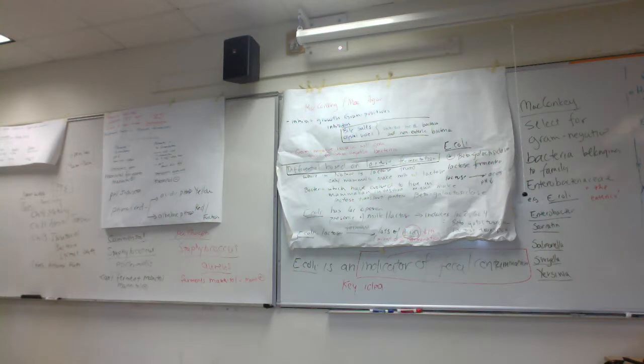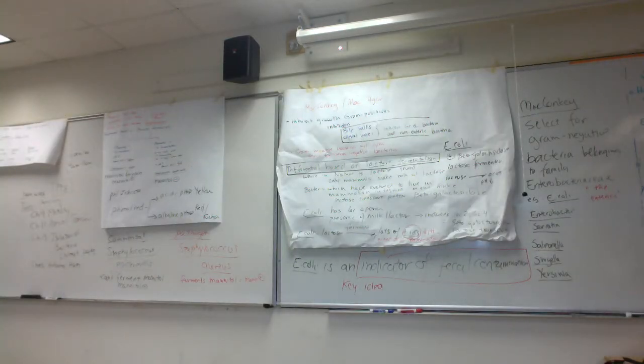So really today it's just a matter of looking at the demo mannitol salt plates, looking at the demo MacConkey plates, looking at the demo blood agar plates, right? And thinking about, is this medium all-purpose, enrichment, selective, or differential? What will I grow? How would I distinguish one type of microbe from another? Okay, so it's really light.